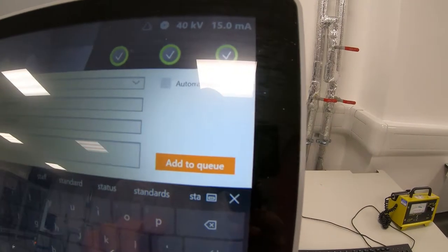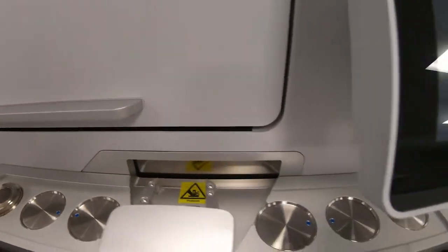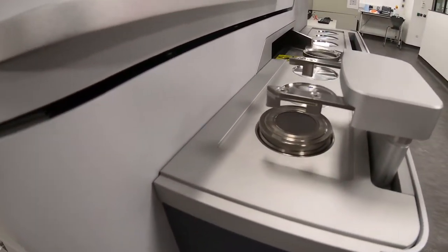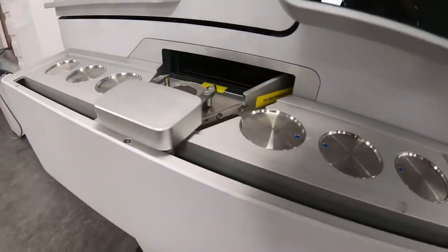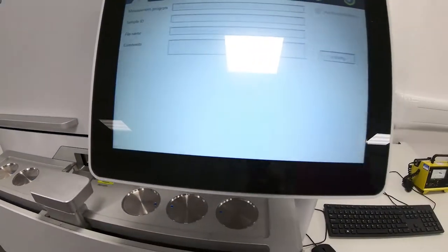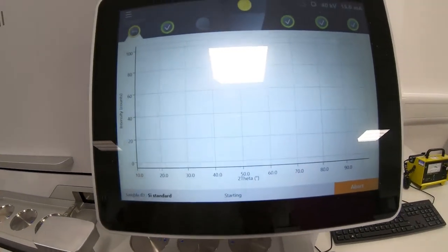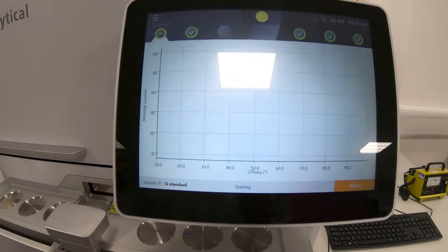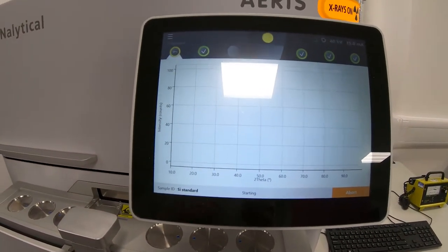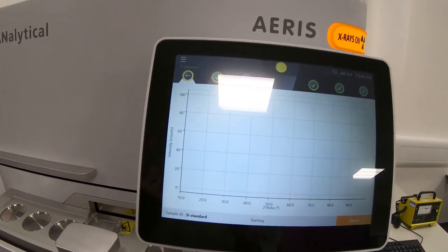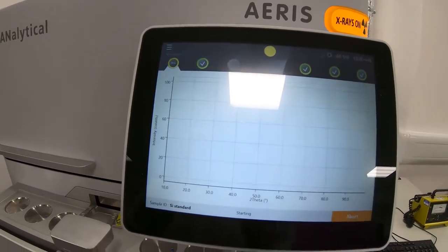As soon as I press add to queue, what's going to happen is I'm going to add this to the queue, and as it's the only sample in there and there's not a sample running, it will immediately start to take it. So if I press this, you see the shutter has opened, the wheel has come out, it's picking up my sample now, taking it over to the circle, dropping it in and putting it inside the diffractometer. That's it, my experiment is now being performed. Now we can't change any of the aspects of how fast the data is collected on this, what range is collected. It's always between 10 and 100 and it always takes 10 minutes to perform. This might limit some of you, but it's a great way for us to get really high throughput on this instrument. If you want to do particular experiments that go only a certain range or collect over a certain range for a longer time, then you'll have to use the D2 or the expert.